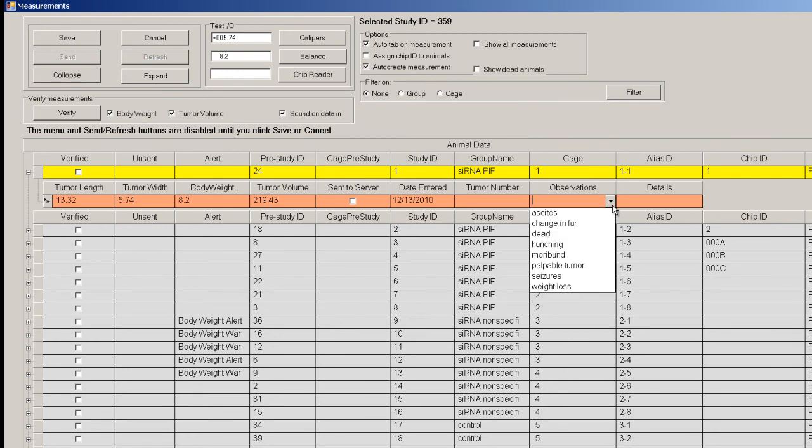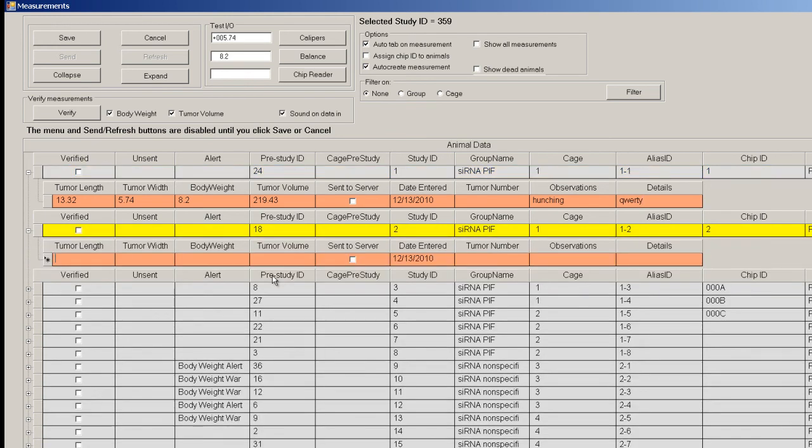Also, you can enter predefined observations that the study director may have defined, or free format observations in the laboratory that the technician simply wants to do. And then you can just jump ahead with the foot pedals once again.